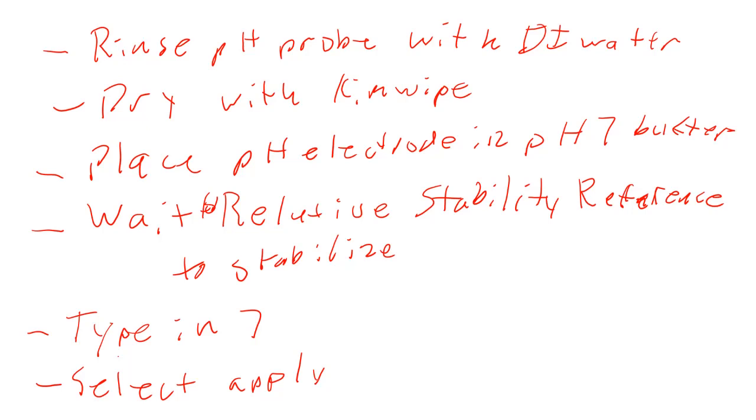So once you do that, you're going to measure 0.10 molar solution of one of the weak acids, and there will probably only be one out, but you're going to get 50 milliliters of one of those weak acids, and you're going to set up your solution.